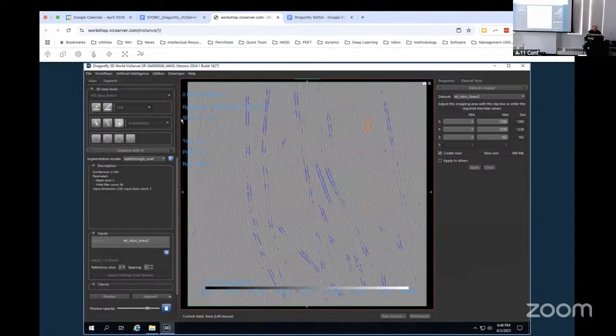Okay, so the easiest way to do this is to drag from the edge of the crop boundary box and just drag it over to include the region you're interested in. Don't worry about the size exactly. Let's just get a chunk that includes that microtubule and those ribosomes. Now, that's the XY axis. Now we need to set it in Z.